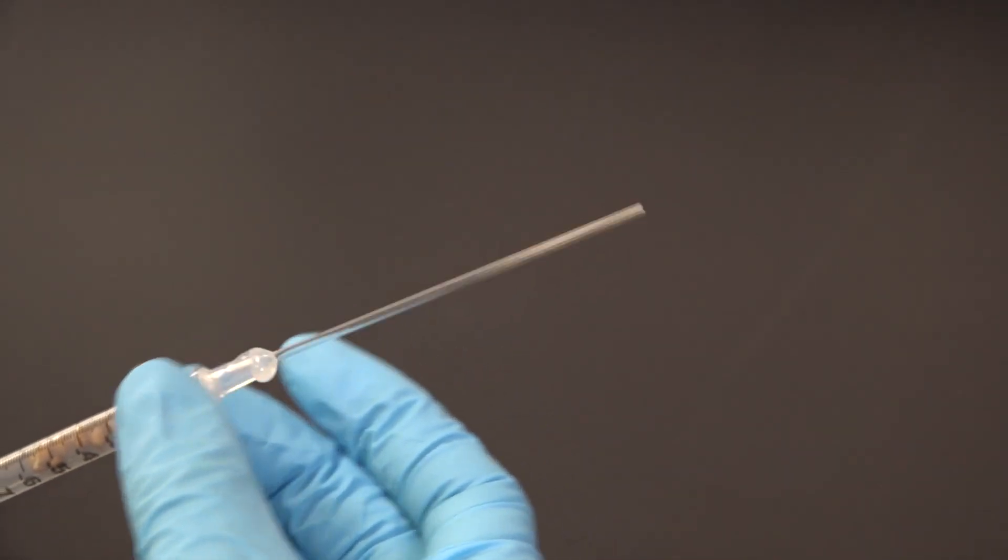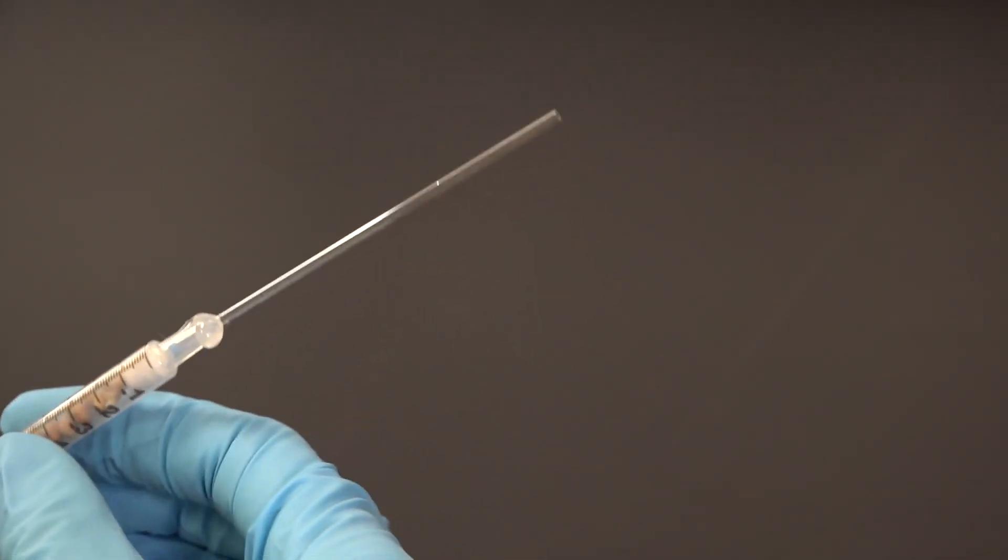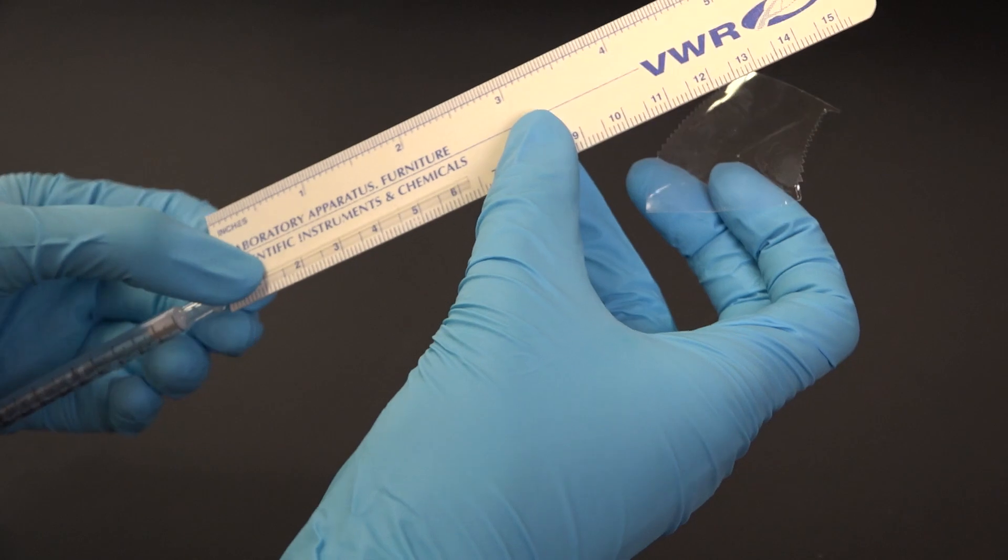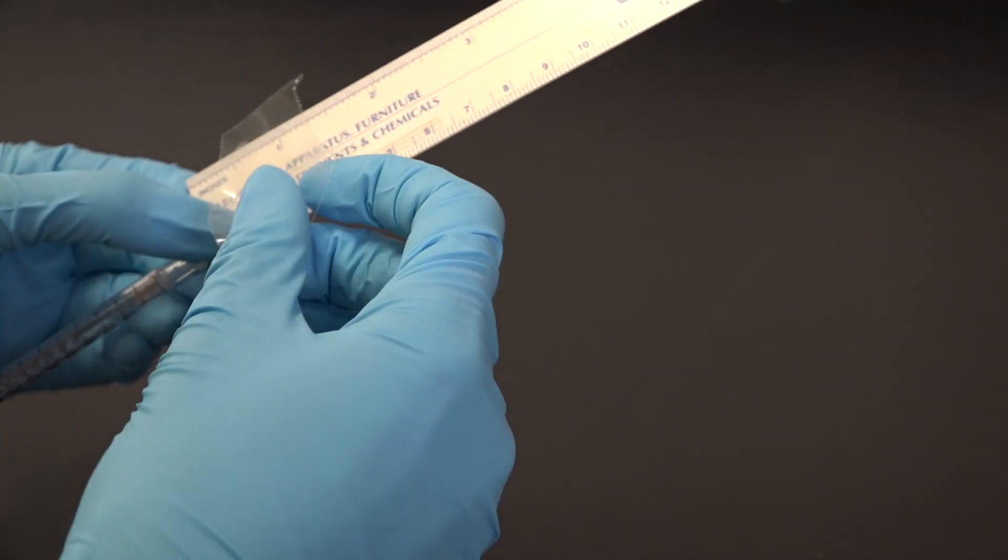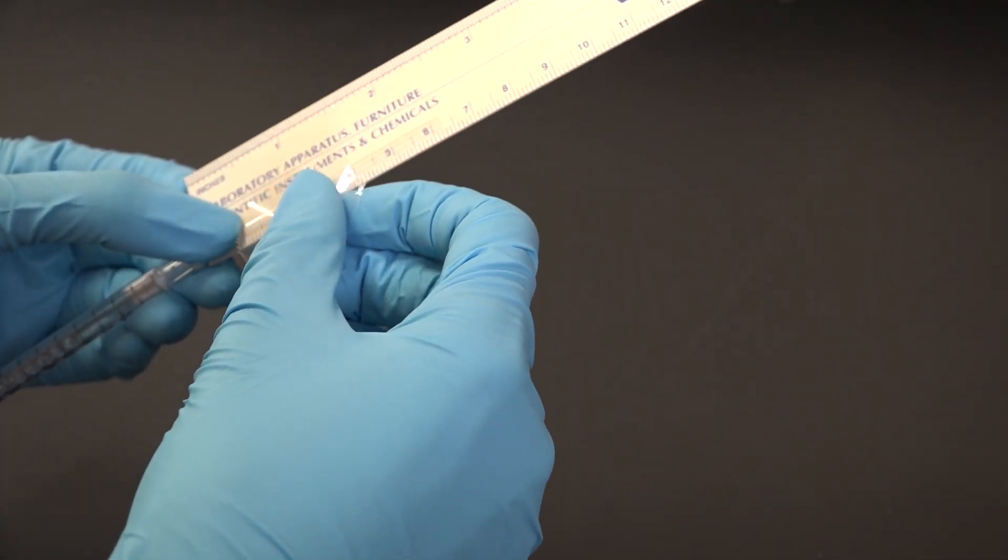Lastly, I'm going to place a couple washers around the barrel of my respirometer for added weight. You'll see why in a minute. And then I'll tape a ruler to the capillary tube so that we can keep track of how far our fluid moves.